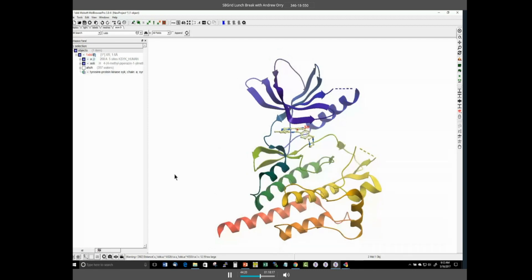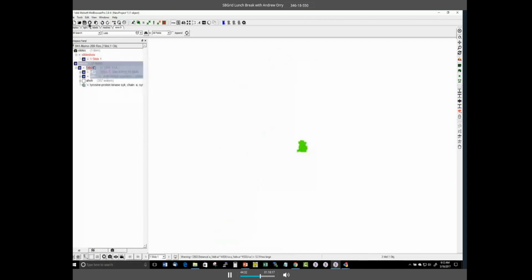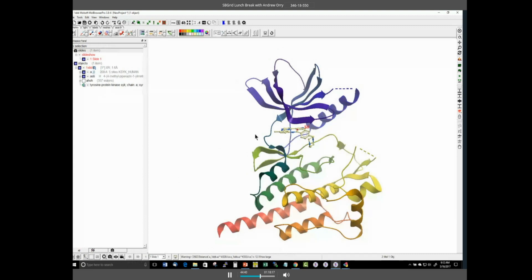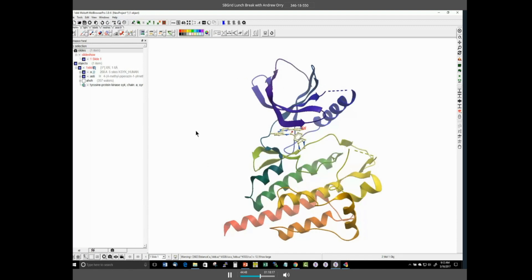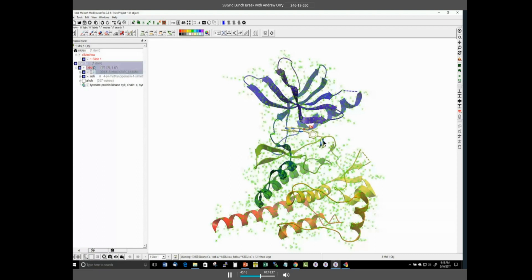We may want to make a slide of this global view of the structure. There's a slide button — a camera icon — which you click to make a slide. If we change things and mess up, we can always go back to our original slide by double-clicking. In the ICM workspace you'll see that 1XBB has three molecules: the A chain, the ligand, and the water molecules. We can toggle each on and off.